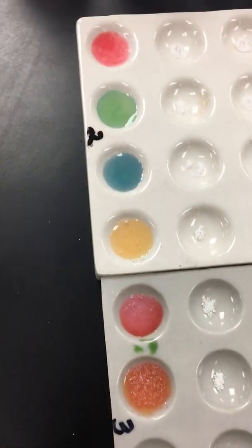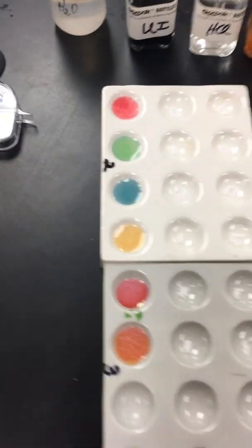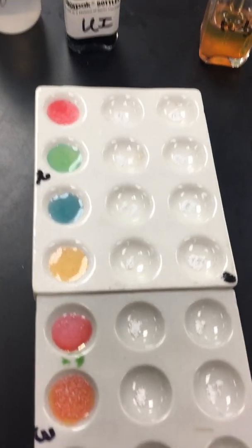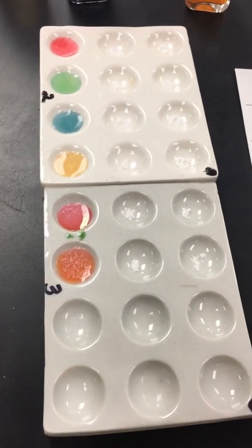All right, so there's the universal indicator test. So next is the hydrochloric acid test. So we have hydrochloric acid. We're going to add it to the second column.